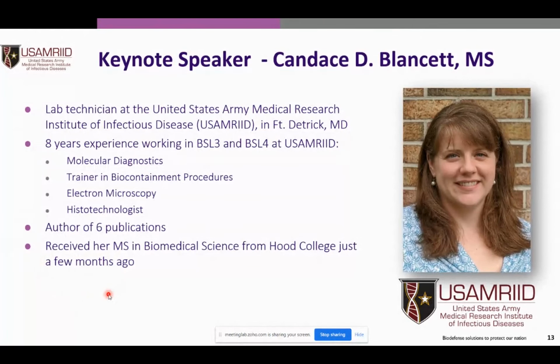Sorry, that went a little faster than I meant for it to. So as Steve said, thank you guys for coming, and thank you, Stephen, for having me here to speak. I appreciate everybody's time today. I've been at USAMRIID for about 8 years, and some of that time has included working in the electron microscopy lab. So I'm going to share with you some work we did, including the mPrep capsules into our negative staining procedures, and then also a virus quantification protocol that we updated.